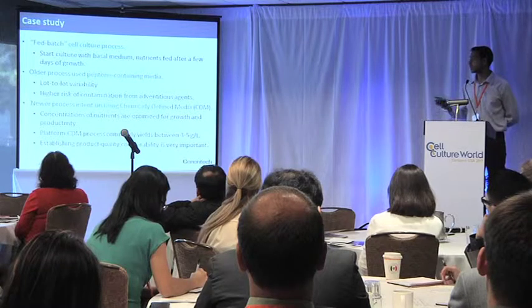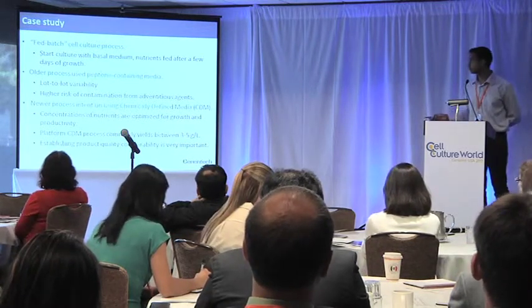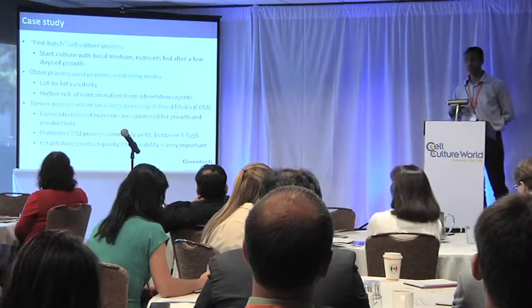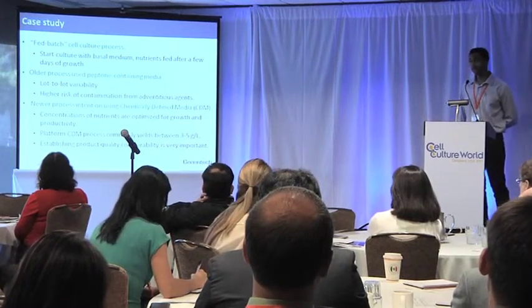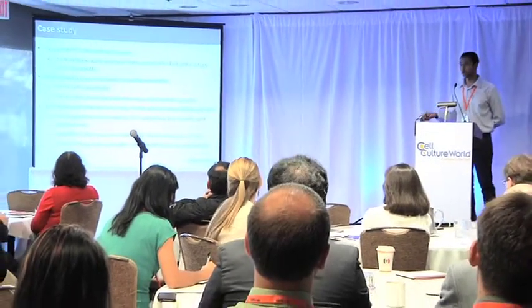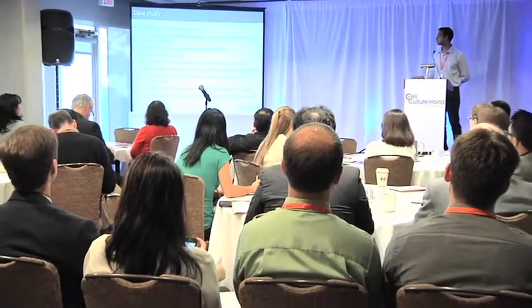And at Genentech, in the platform process, the concentration of the media is optimized based on growth and productivity, because obviously everything else will change according to cell line and the process. And typically, our platform process yields between 3 to 5 grams per liter of the protein of interest. However, in this particular case, since we have an older process, establishing product comparability was very important.